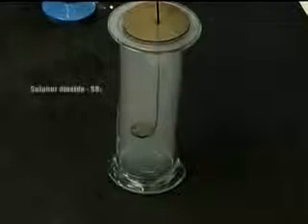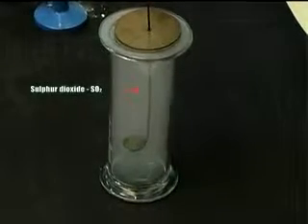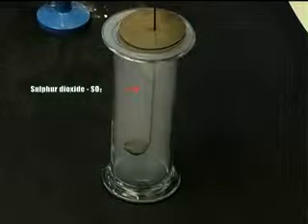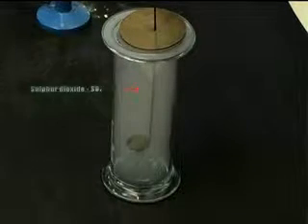To evolve the gas known as sulfur dioxide, the gas is contained in the glass jar as you see here.